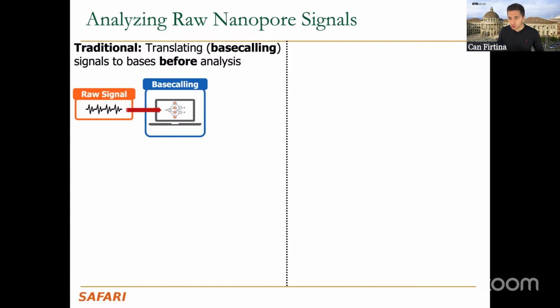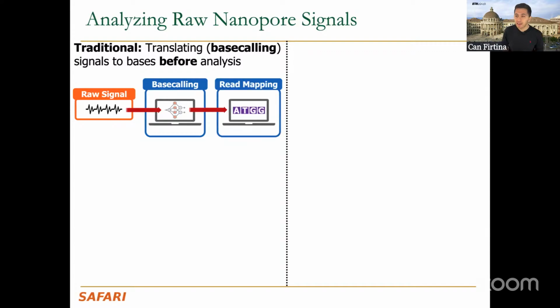They can, of course, contain more modern layers such as LSTMs, RNNs, CNNs, and so on. Essentially, we input the raw signals to DNN-based base callers, and they understand the complex structure of the electrical signal and extract the nucleotide information from it. So it's like a translator for us, right?